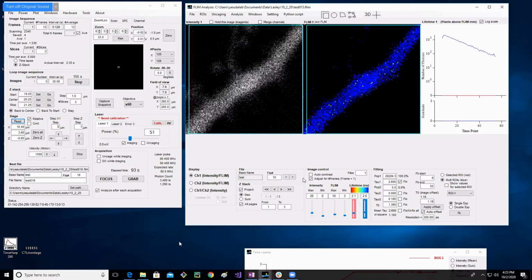If you're 80 microns deep, it's going to be really hard for the uncaging laser to uncage the glutamate efficiently. You'll also notice that your neurons tend to be much dimmer because, again, the fluorescence is hard to get out from that deep, and your excitation laser is a little bit hard to get in.